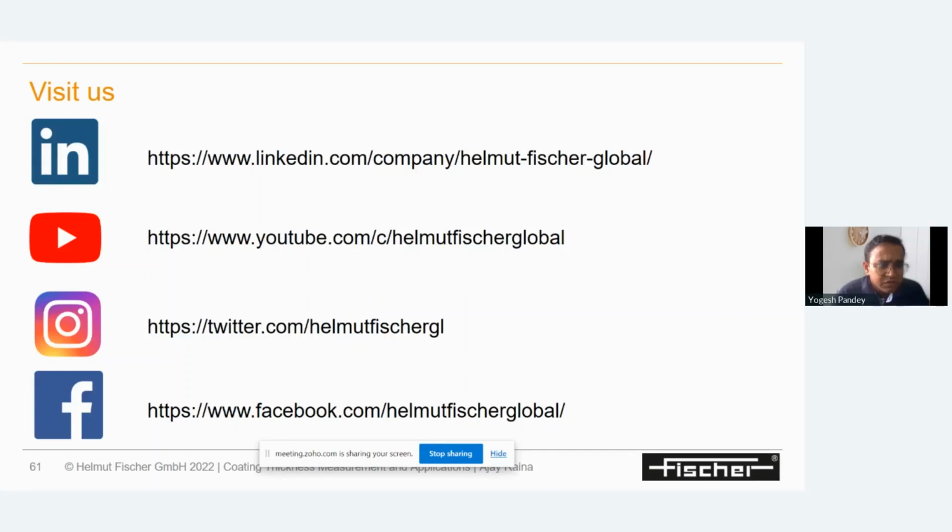So next is how we can do coating composition with XRF. I think we have already explained the whole process of detection of chemical composition with XRF. For example, if you have a nickel zinc coating, better we can send him this PPT again, and if he comes across some query, we can coordinate with him.